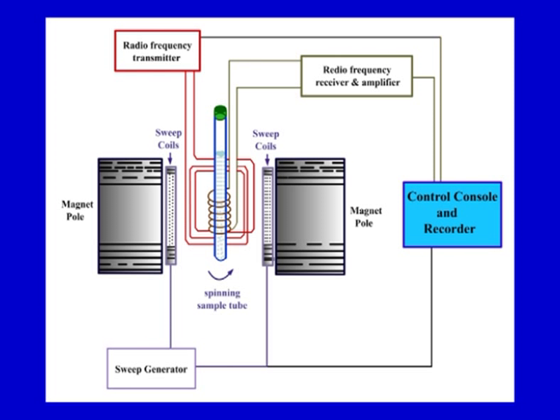At the correct resonant frequency or radio frequency, there will be a signal from the transition of nuclei from a lower state to a higher state, and the applied magnetic field is provided by the magnets. Resonance will occur only when the frequency or the energy matches the two resonating states, and that particular spectrum will be collected and then analyzed as we have discussed.